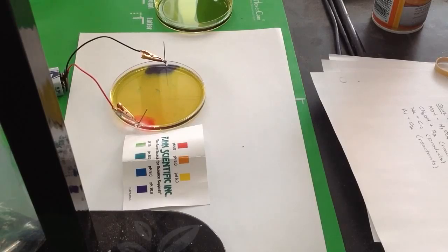Okay, we've said this before, what do you get when you break H2O down? H and OH. H and OH is H2O. So you're making H2, and right here you can see the bubbles. That's H2 gas. Now that's another hint for you. Why is that end turning red? And then why is this turning blue? If you're decomposing water, this is going to be aqueous because it's just OH, which is an ion, right?